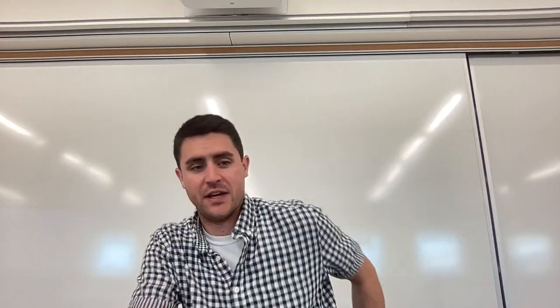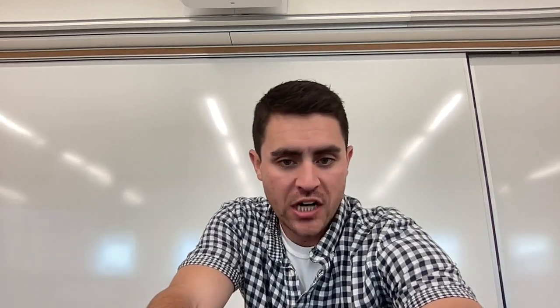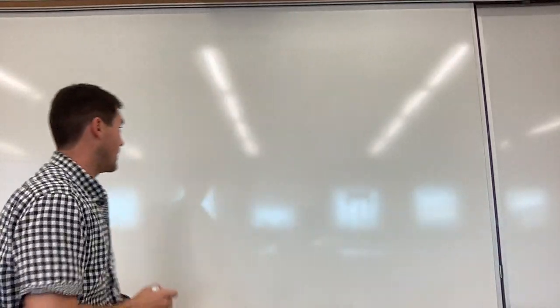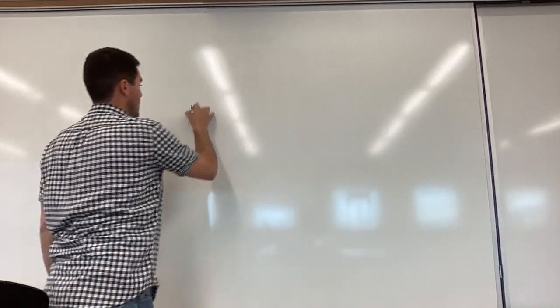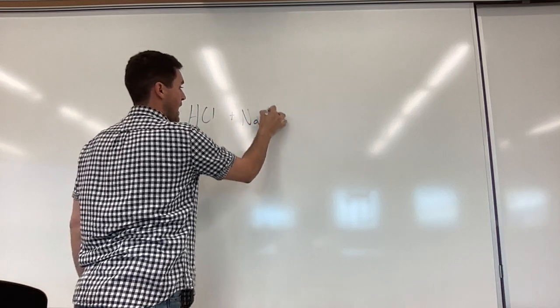I'm back in the chemistry classroom today. We're talking about acids and bases and neutralization reactions. We talked about what an acid was. We talked about what a base was. We never talked about what would happen if we reacted acids and bases. So today, we're going to take a strong acid, hydrochloric acid, HCl. We're going to mix it with sodium hydroxide.